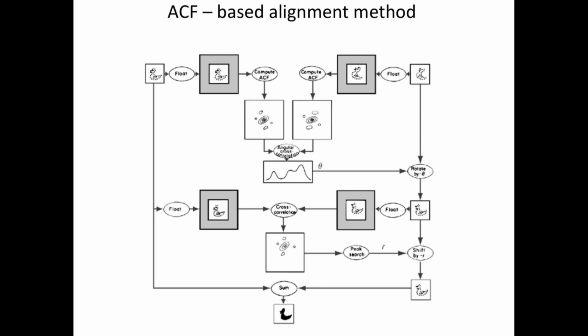We have to probe the 2 different orientations and find out which one gives us the highest signal. Right? But the entire thing is now a workflow that always gives us the correct translational and rotational alignment.